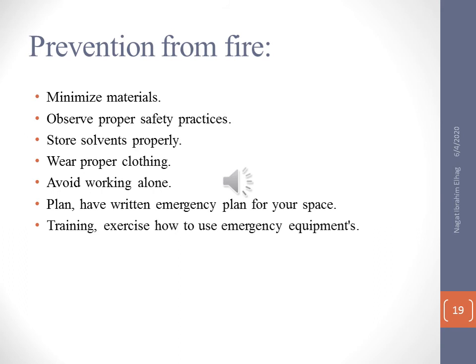Also, have a written emergency plan. The emergency plan of your lab should be written in a good way, distributed to all lab workers, and also put on your walls to make the lab workers remember how they can deal with an emergency or accident of fire.